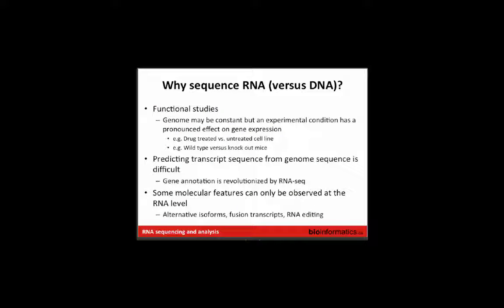Okay, so why sequence RNA versus DNA? I originally created this slide because I spend a lot of time talking to DNA people at genome centers who say, we'll sequence the genome and learn everything. But there are some things that are a lot easier to learn by studying the transcriptome. And of course, functional genomics would be right at the top of that category.